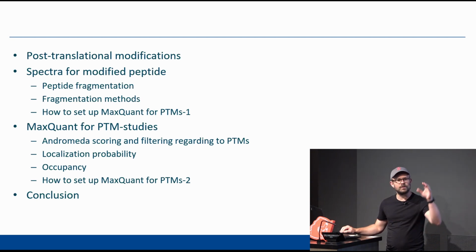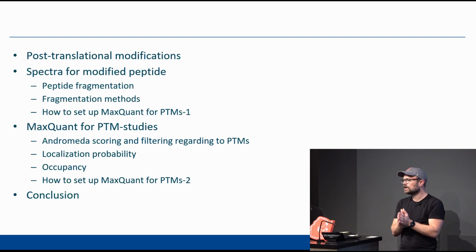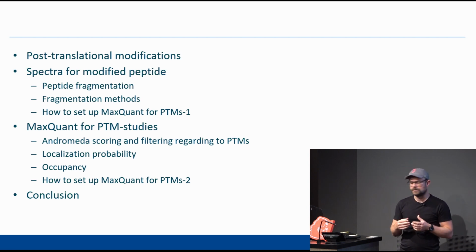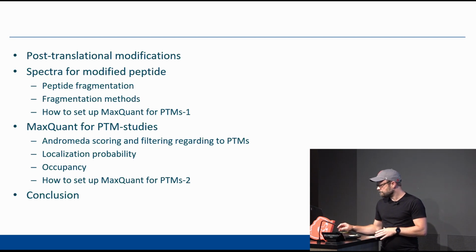Afterwards, we talk about the whole workflow in MaxQuant, like the identification of modified peptides. There are some filtering steps, and then we come to calculation of localization and occupancy or stoichiometry.